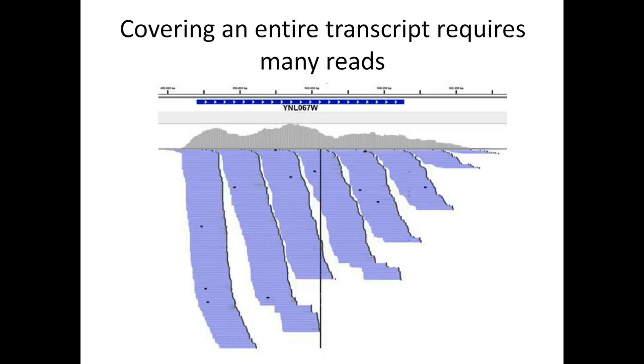Okay. Another attendee asks, what did you use for your sample prep? I'm not sure exactly which part of the sample prep they're talking about, but initially we purify the RNA from the cells with a phenol-chloroform extraction, and then after RNA purification, we use the QuantSeq library prep kit. Part of the RNA sample prep does involve a DNase treatment to get rid of the genomic DNA prior to that. We do a limited treatment for 30 minutes at 37 degrees, and then we purify the RNA, and then we use the QuantSeq library prep kit directly.